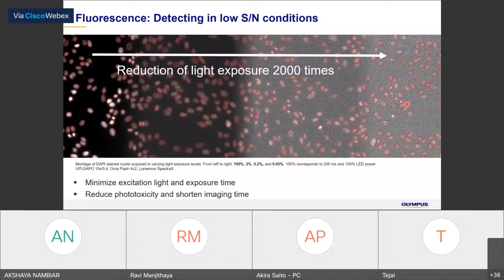But if we give the ground truth for this condition, train the neural network, and use it on other real images, then of course it will be identified in a good way. But the probability might be a little bit lower than the other high contrast ones.